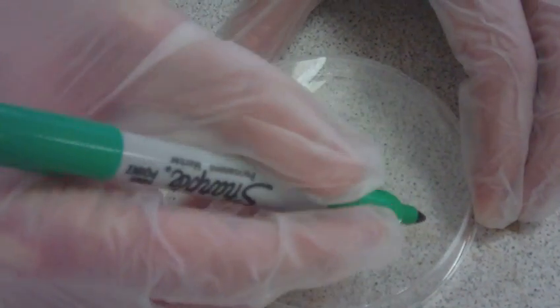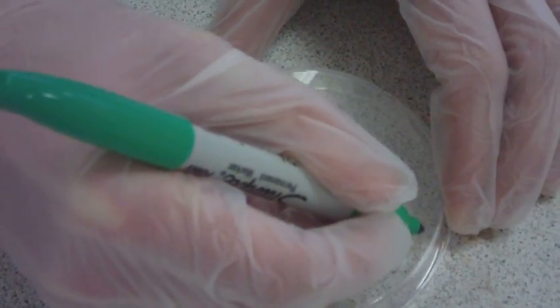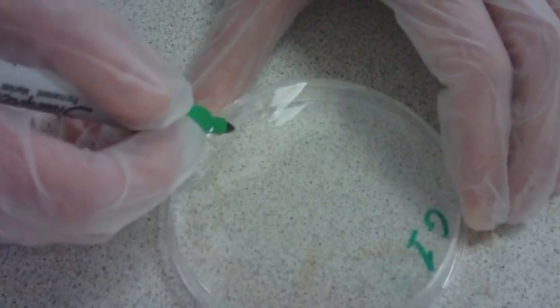Using a marker pen on the bottom of the agar plate, write your group number, date, and bacterium name.